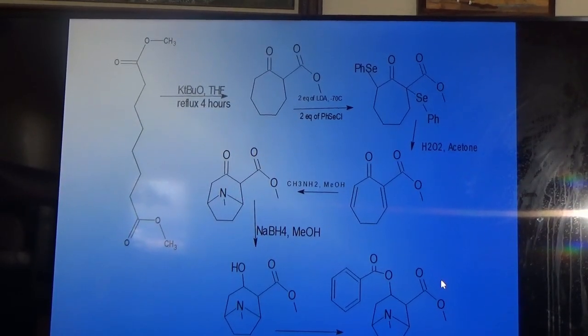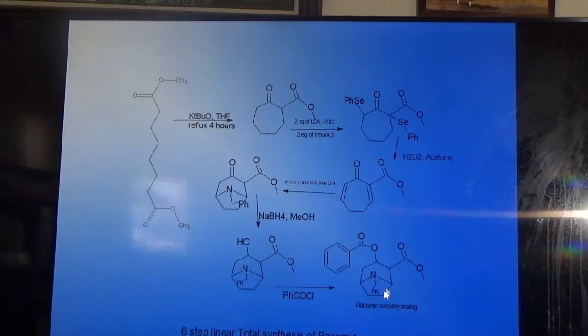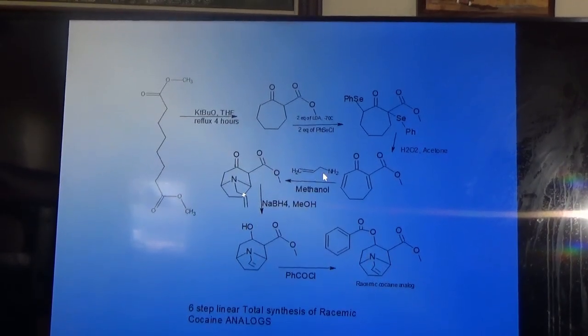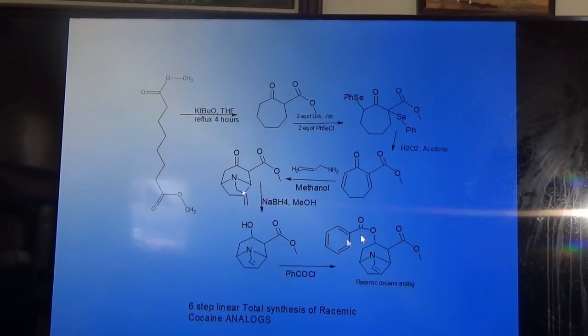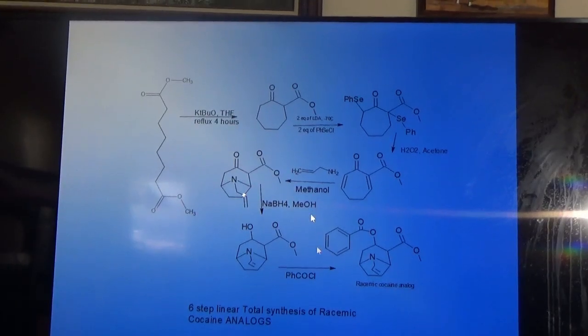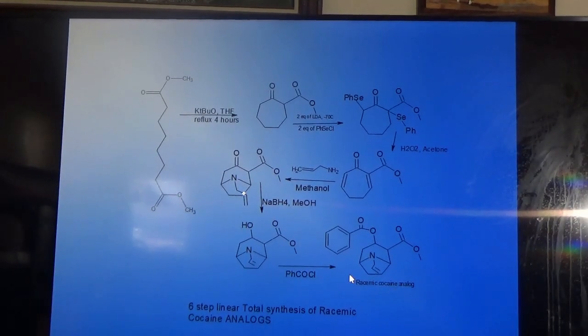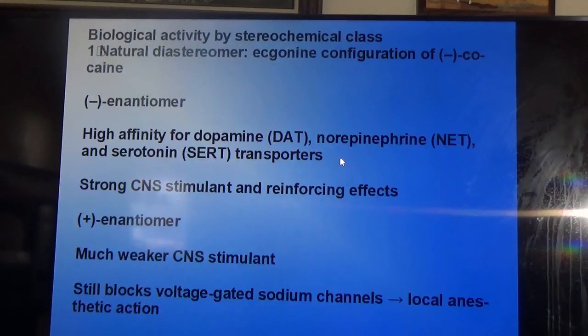So having made the racemic cocaine, we can make analogs. Instead of methylamine, one can use other primary amines, such as benzylamine for one example, which gives the analog with the benzyl group here. You can use allylamine, we did, and we got excellent yield. Just like methylamine, you get the allyl nitrogen. So the nitrogen methyl is replaced by allyl, and we also did tertiary butylamine, a primary amine, and that also added. We added several primary amines, and all of them gave the racemic cocaine analogs. So this is an excellent way to make analogs by changing the structure of the primary amine.